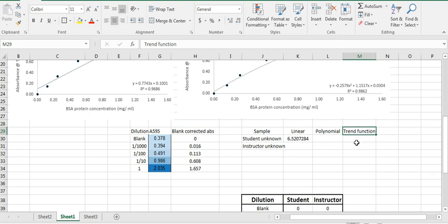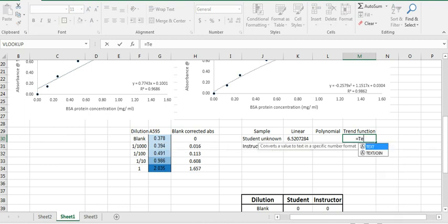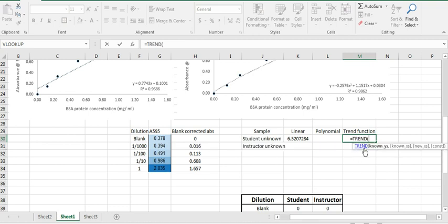I wrote trend function to show you one other way that you could potentially look at the quantification. And that is through Excel's trend function. Here, you're going to say trend and the function should pop up automatically. It's going to ask for your Y.